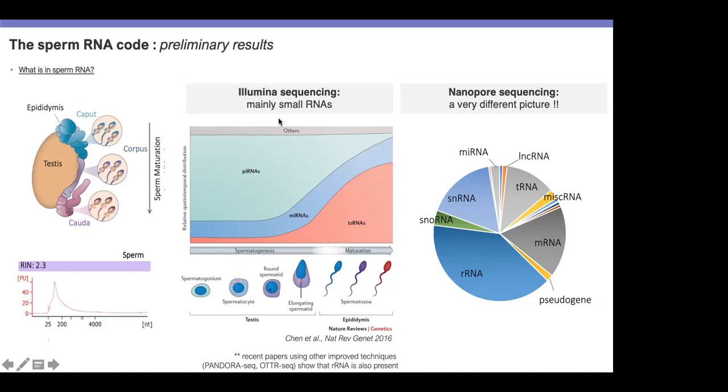And you're running proteins at 37 degrees, which is a sequencing temperature, or whatever you choose. But if you put your proteins at 37, they're not going to be very happy for a very long number of hours, right? You put them in the freezer usually to keep them happy. And basically the pores start dying. Also, they will start being clogged. Why they die, we can argue about different things, but basically they will die.